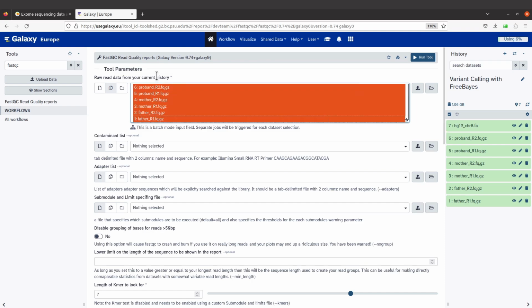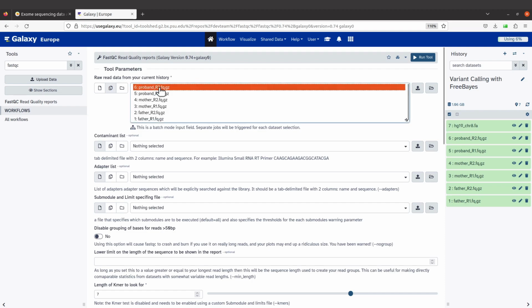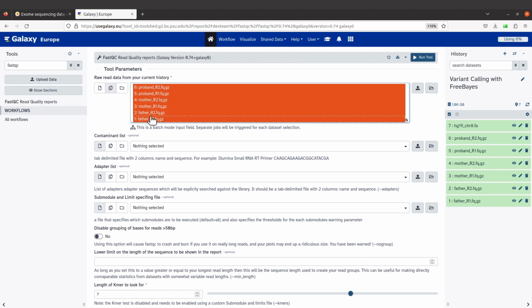So click it, and then all of them will be selected for you. Okay, that's what you have to do. Let me just go over. So click on number 6, press the shift button, and then click on number 1. And then everything will be highlighted for you. Alternatively, you can click on one of them, press the control, and then click on the other ones as well. That also works. But the quickest way is to use the shift method, the one I just described for you.